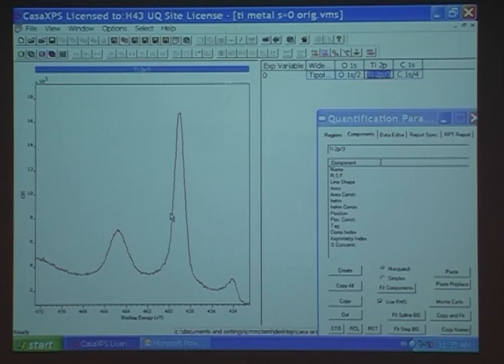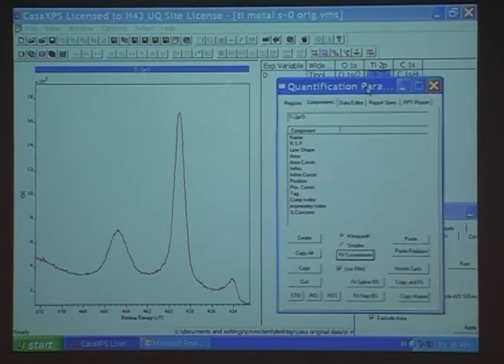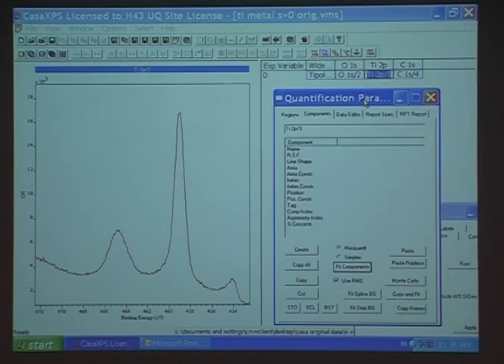If you take silicon, it'll only develop about 15 angstroms. If you take aluminium, always got about 40 or 50 angstroms. Protects the aluminium, instantly oxidized. Now, I've got to fit this very carefully. So this is advanced fitting. Okay, I'm just going to show you what to do so you get a bit of a feel for it.